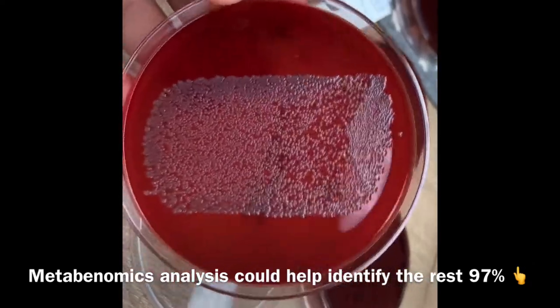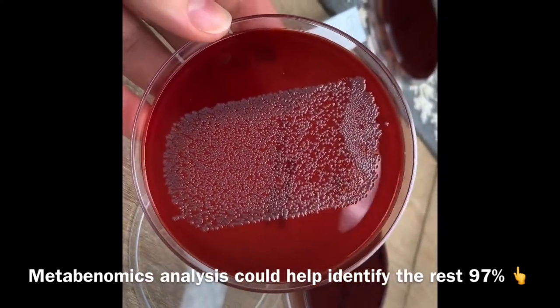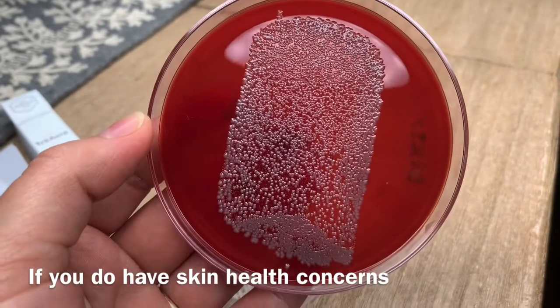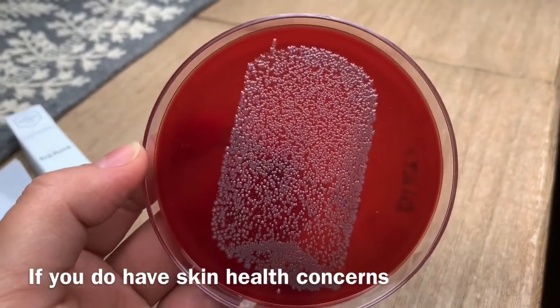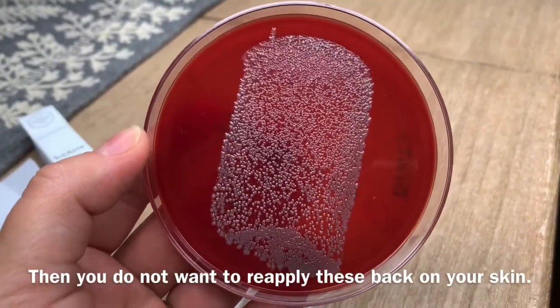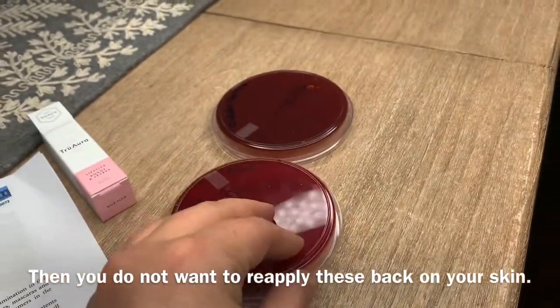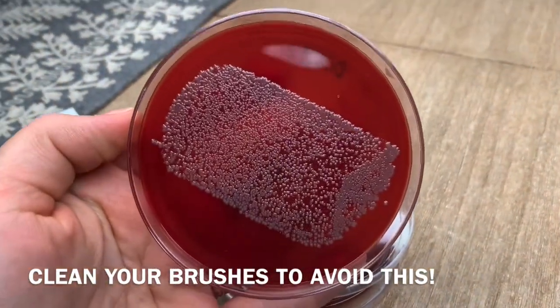Even with this quick and dirty approach, you can see how many different cells are growing on those brushes. If you have some issues with skin like acne or eczema, then in some parts of your skin you might have more bad bacteria rather than good bacteria. If you keep using the same brushes without washing them, it means you keep reinfecting your skin with these bugs. Especially if you have any skin issues or concerns, you have to be extremely careful, and this is why we have to clean them on a regular basis.